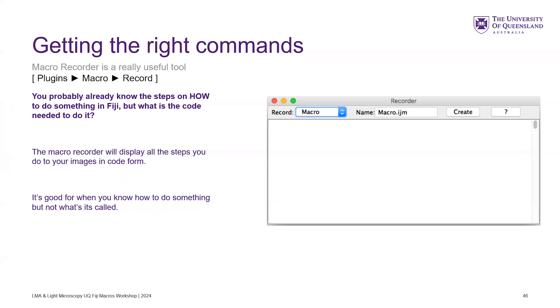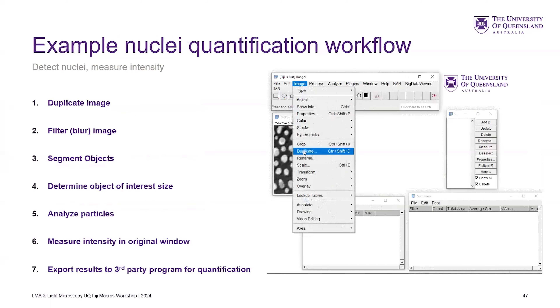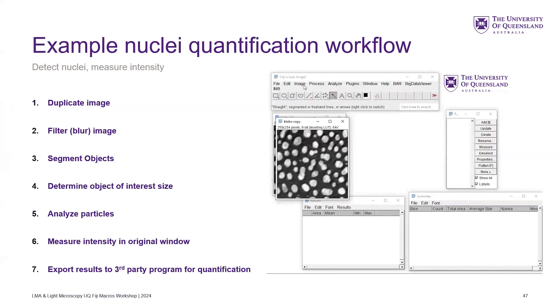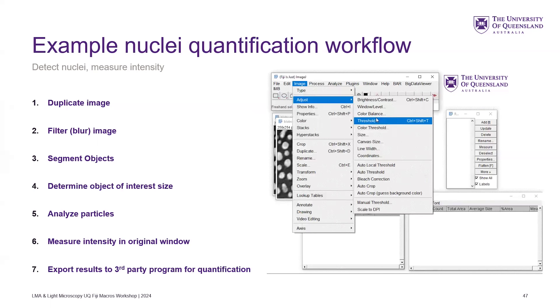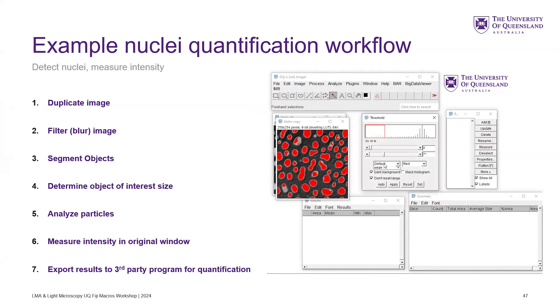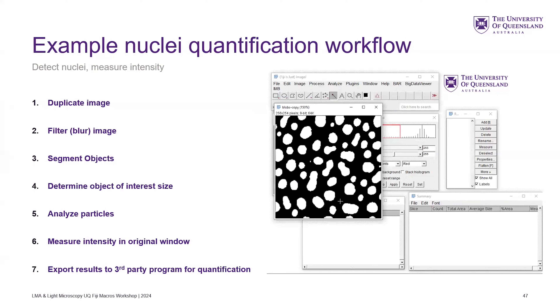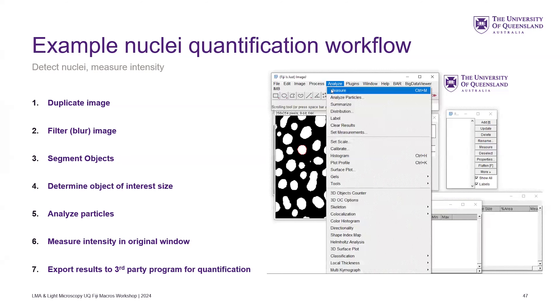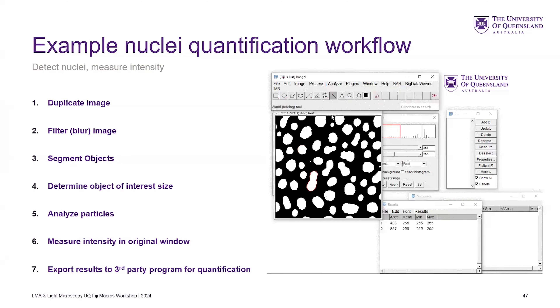That's good for when you know how to do something. Here we're going to do an example. I've opened this image called blocks and I want to duplicate it and make a new window for a copy. I'm going to run a median filter to blur the copy, and then we're going to segment it — threshold it. Looks pretty good. I could manually adjust things or just use one of the defaults. Hit apply and now I've got my binary image. These would be nuclei, bacteria, cells — use your imagination. You could then measure some of them roughly just to get an idea of how big they are.